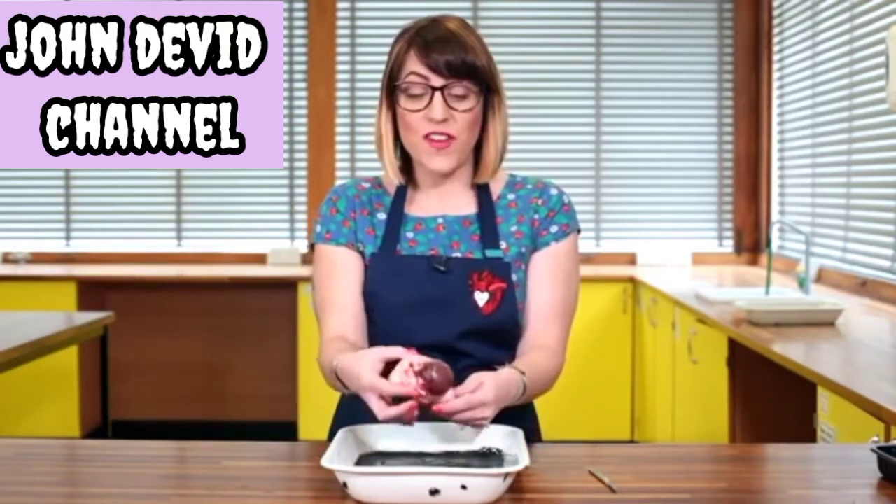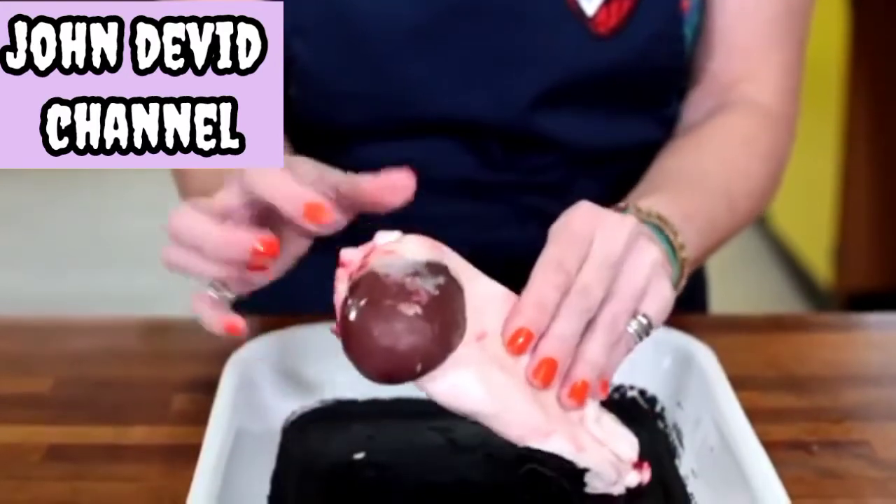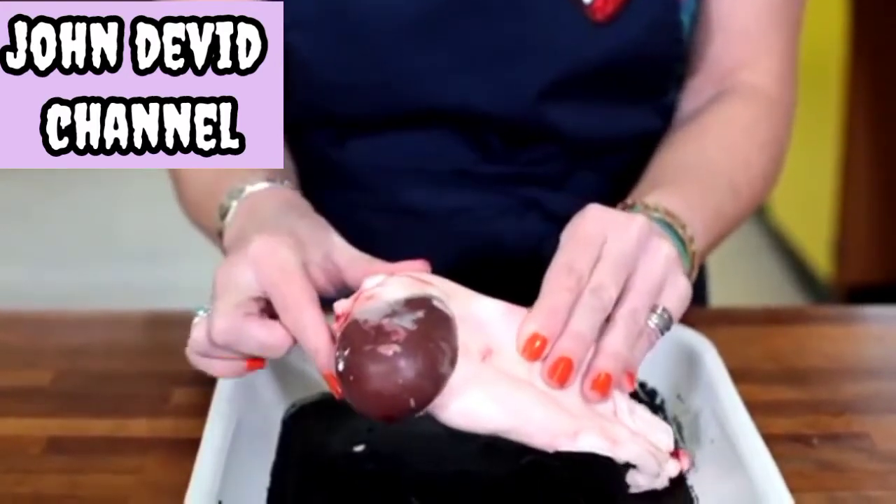Kidney dissection. Today's video is about dissecting a lamb kidney. When you receive your sample it will come with the fat attached. This fatty layer is there to protect the delicate surface of the kidney organ.